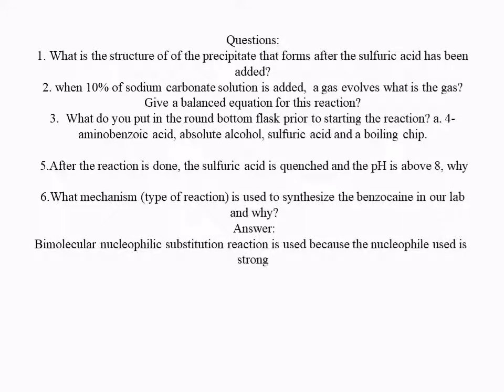Questions. Number 1: What is the structure of the precipitate that forms after the sulfuric acid has been added? Number 2: When 10% sodium carbonate solution is added, a gas evolves. What is the gas? Give a balanced equation for this reaction.